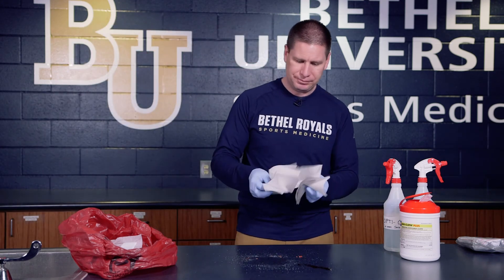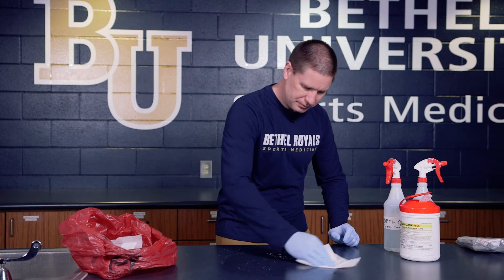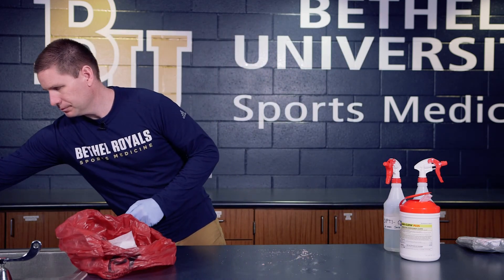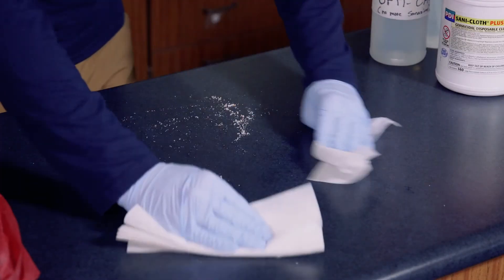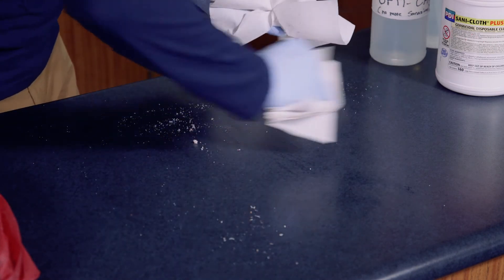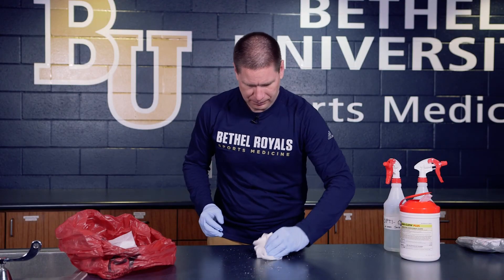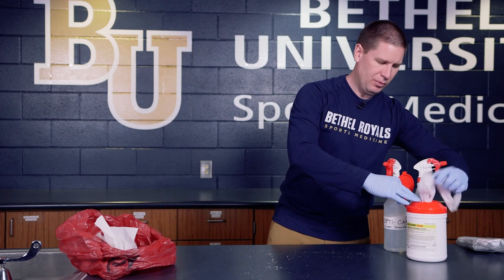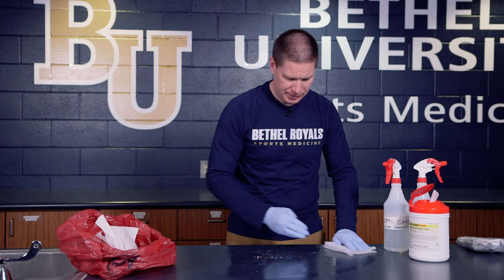Now take your disposable towel and wipe the entire surface, cleaning the area and ideally keeping everything contained. You may also want to grab some of the wetted wipes to make sure the entire surface is cleaned and picked up.